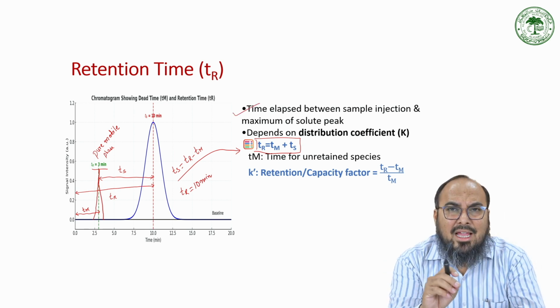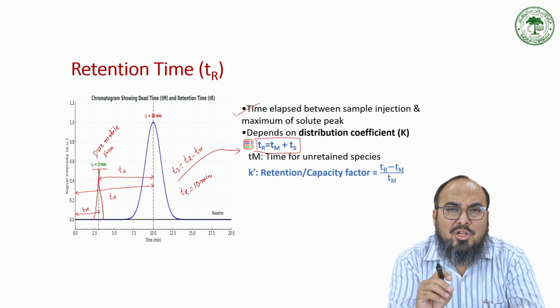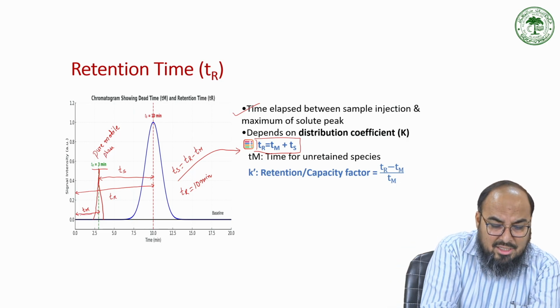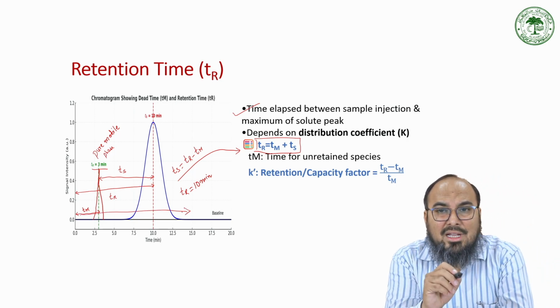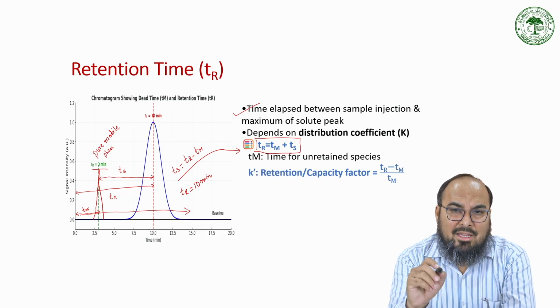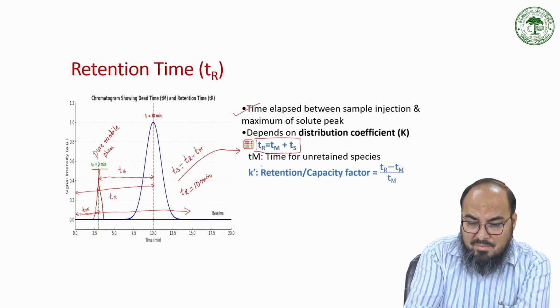So the greater the time of interaction with the stationary phase, the greater will be the time it will take to elute. That is, the solute peak will take the maximum time. So here time is money actually.